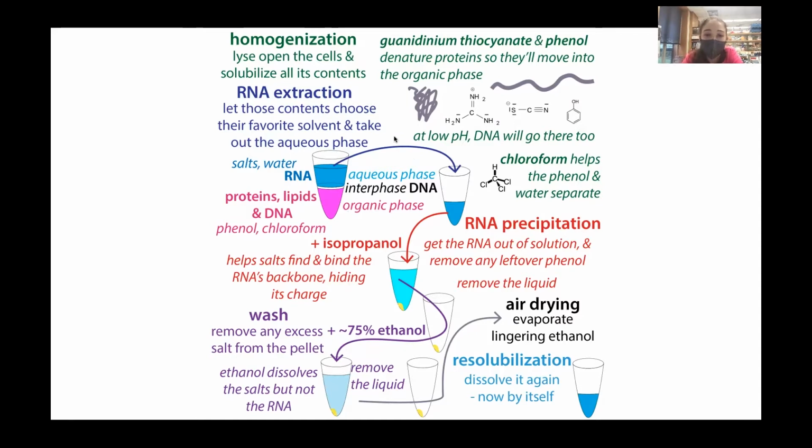There are also, however, the reason it's called TRIzol or Tri. I think TRIzol is one brand's name, I think it's from Invitrogen, and then Sigma is Tri. There's also make-it-yourself versions. But the basic idea is that you can purify three things.